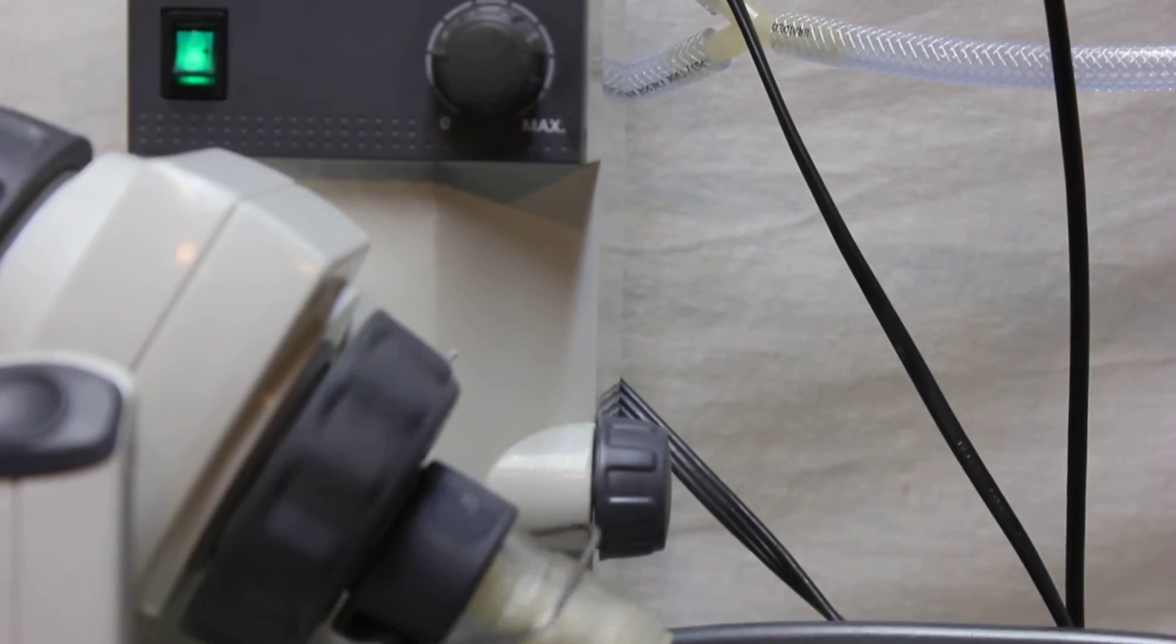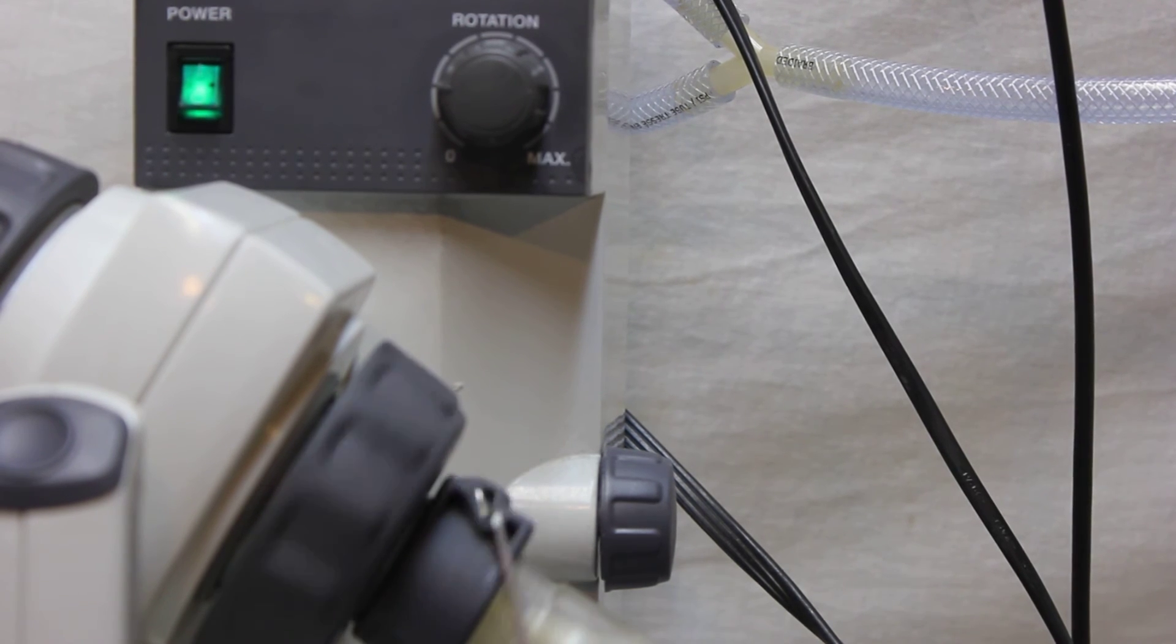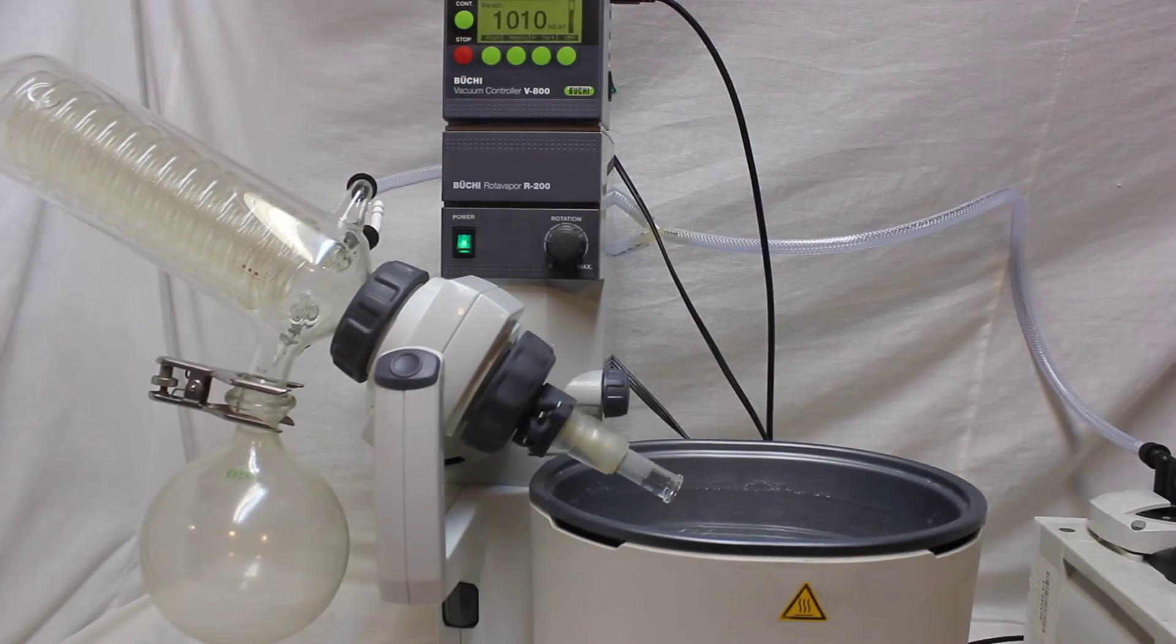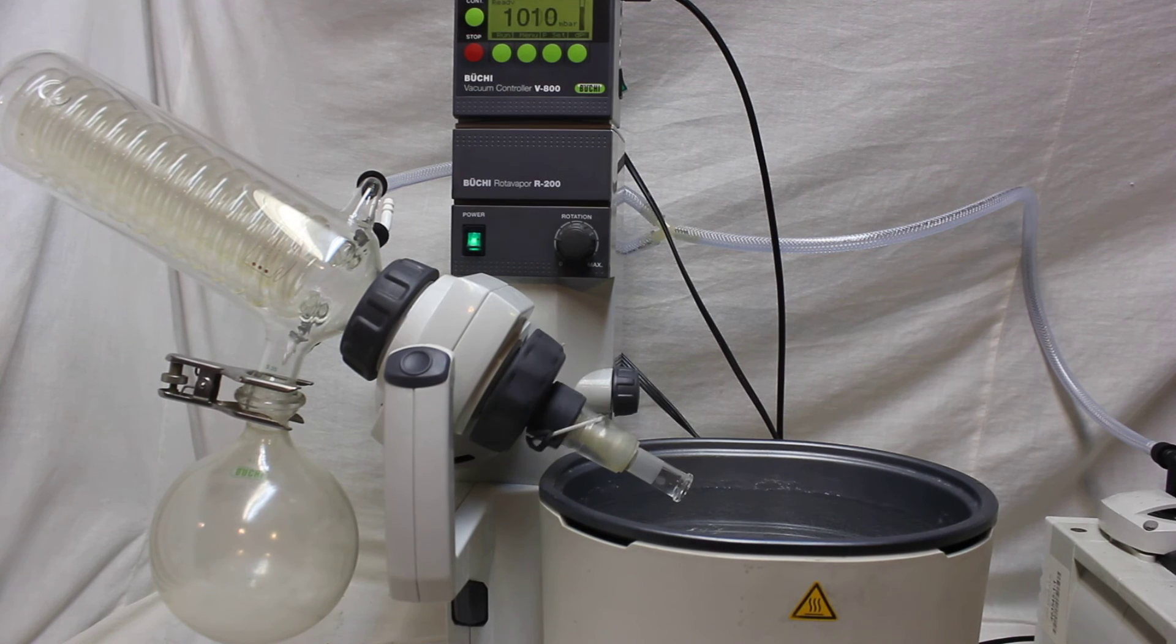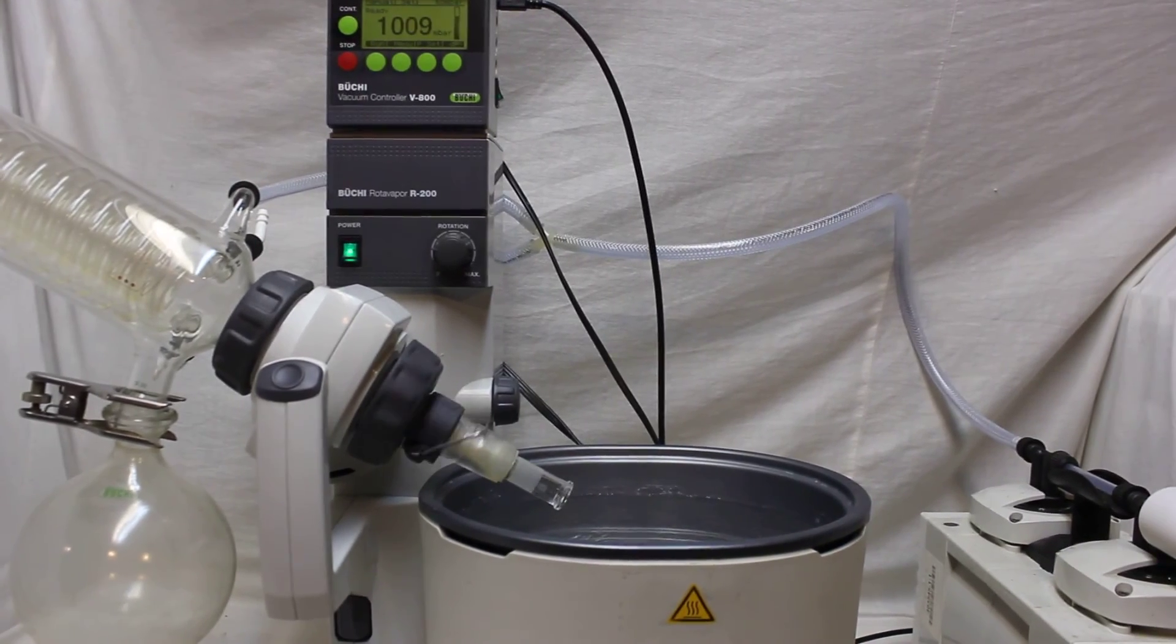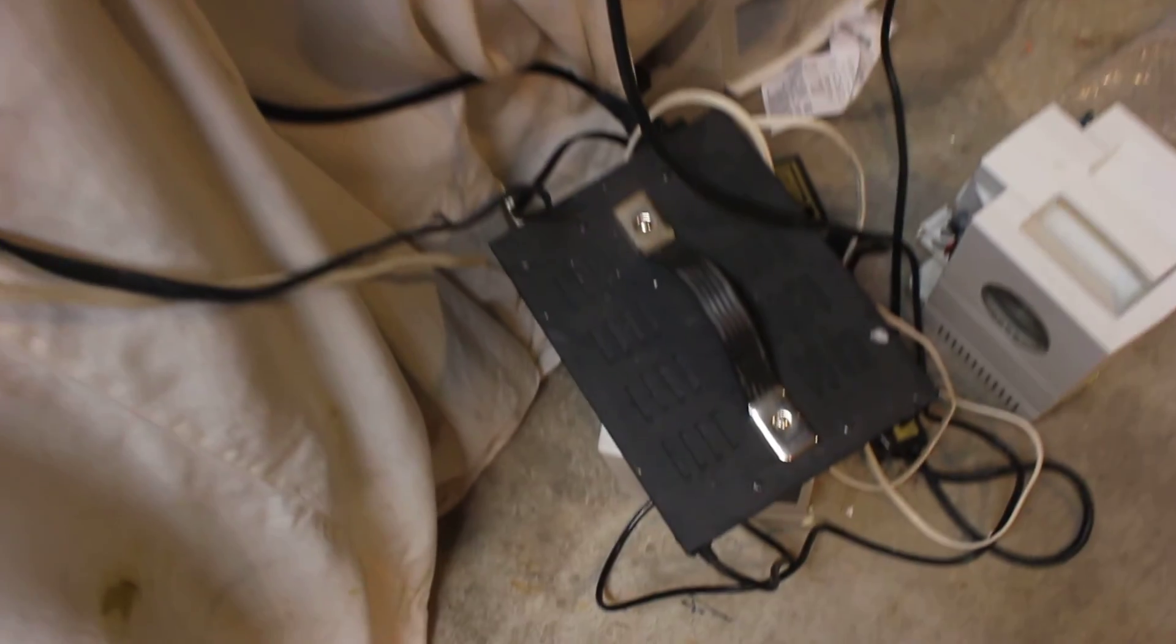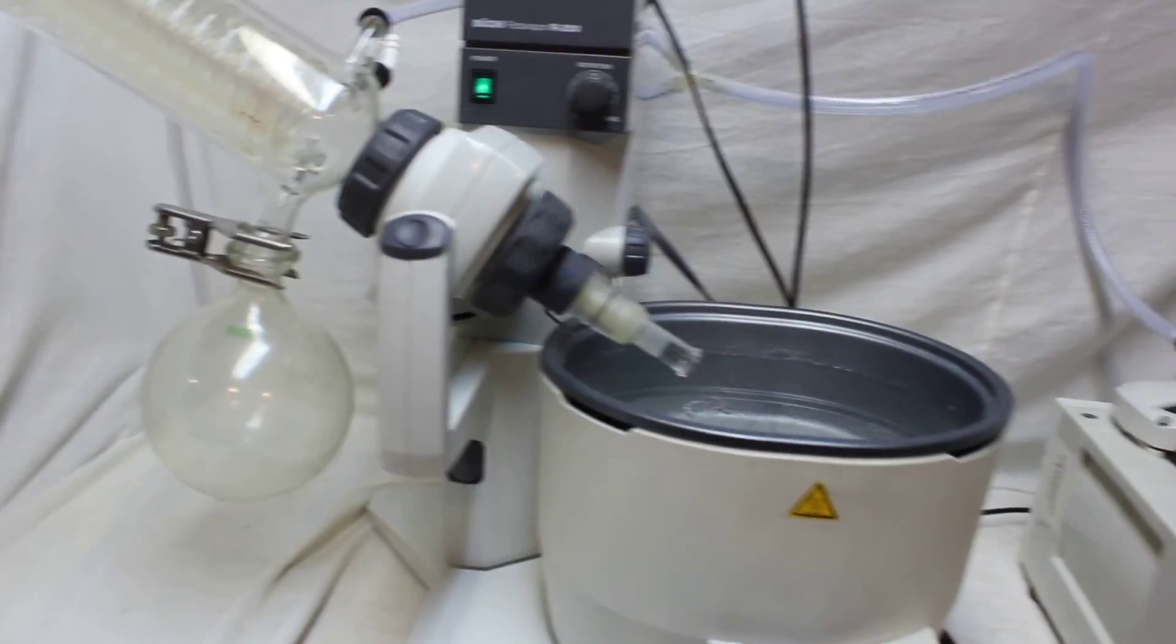You were watching the Buchi R200. One more time, I'm going to repeat: this is European style and this is 220 volts, not 110. If somebody needs to use this in the United States or Canada, they need to use a power adapter, which is not too expensive—maybe one hundred to two hundred dollars.